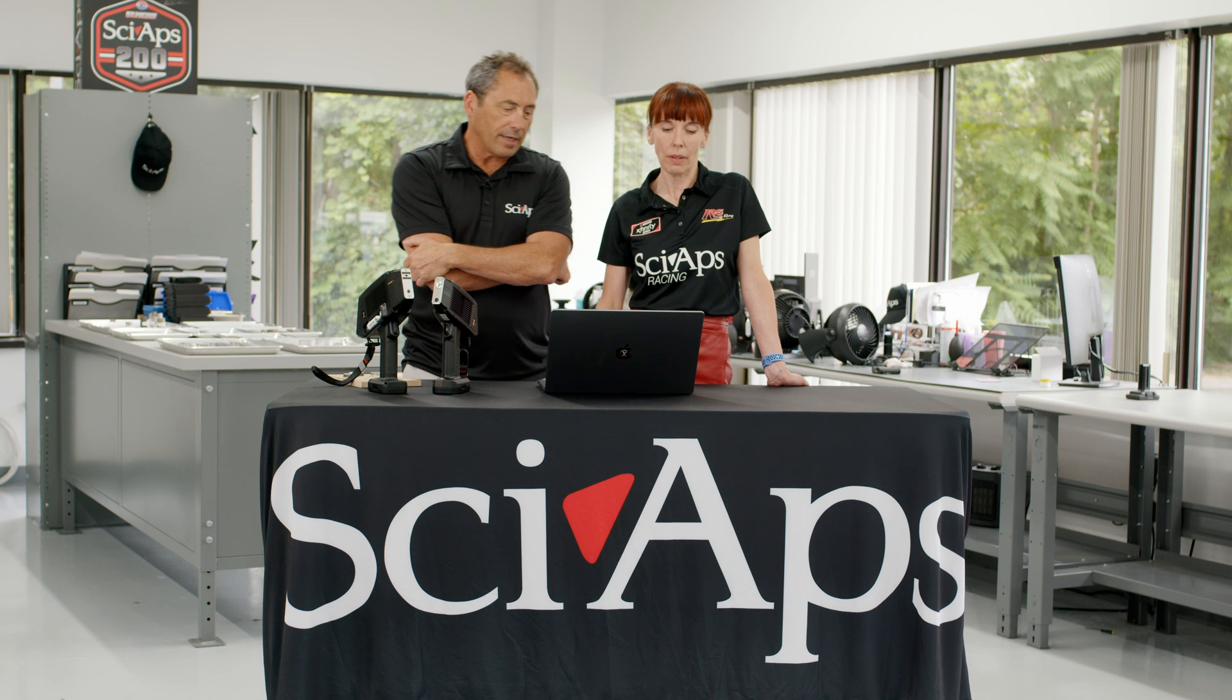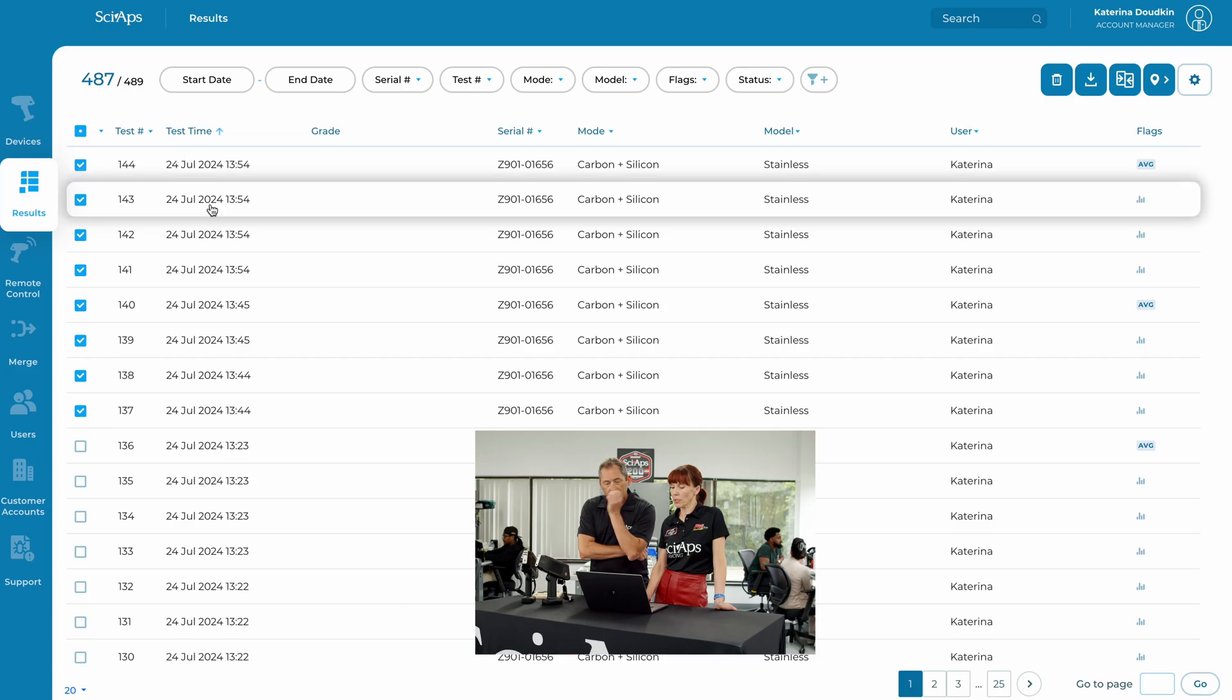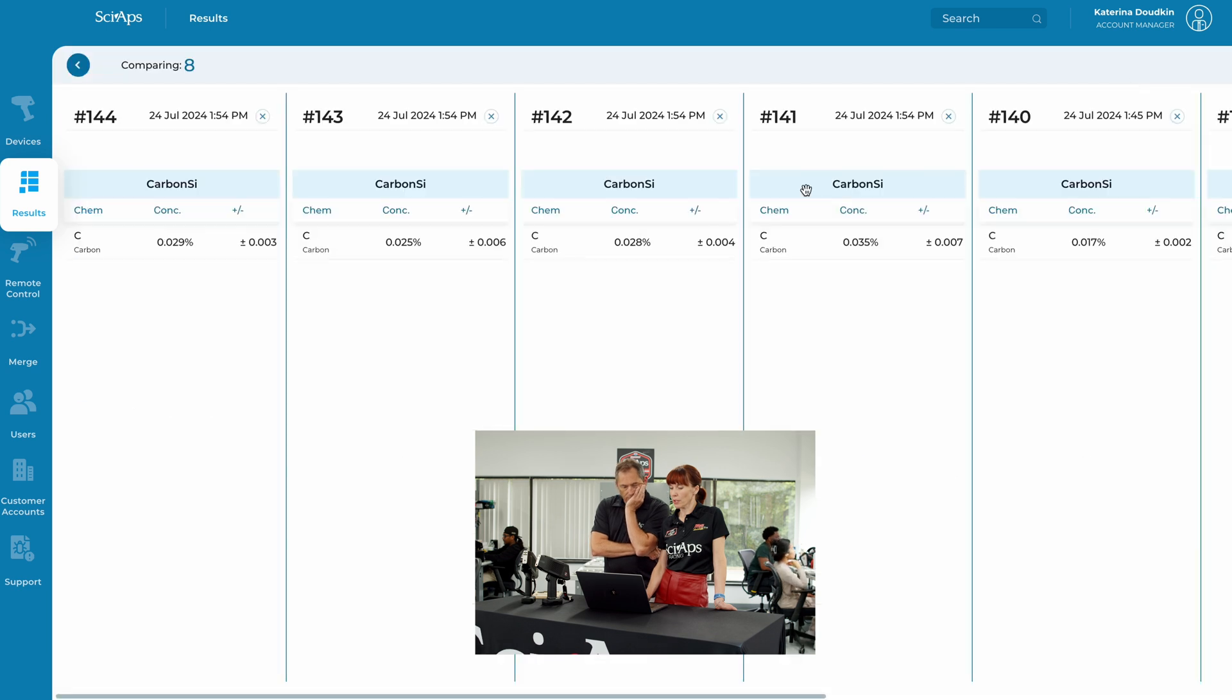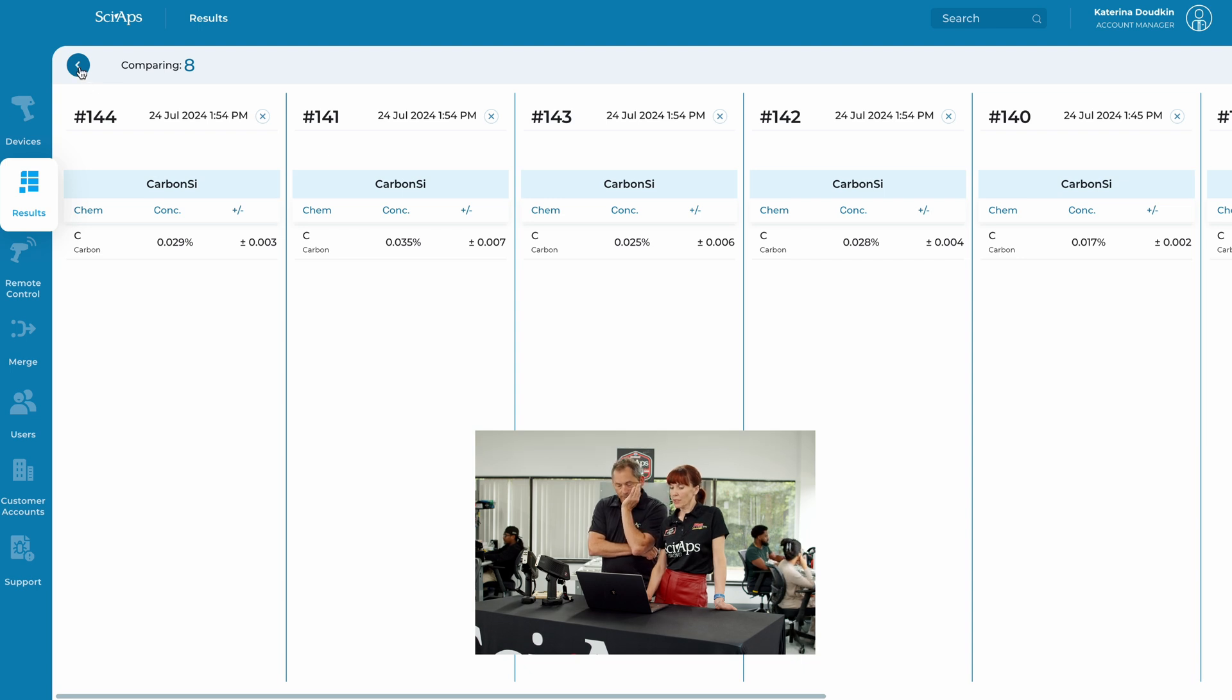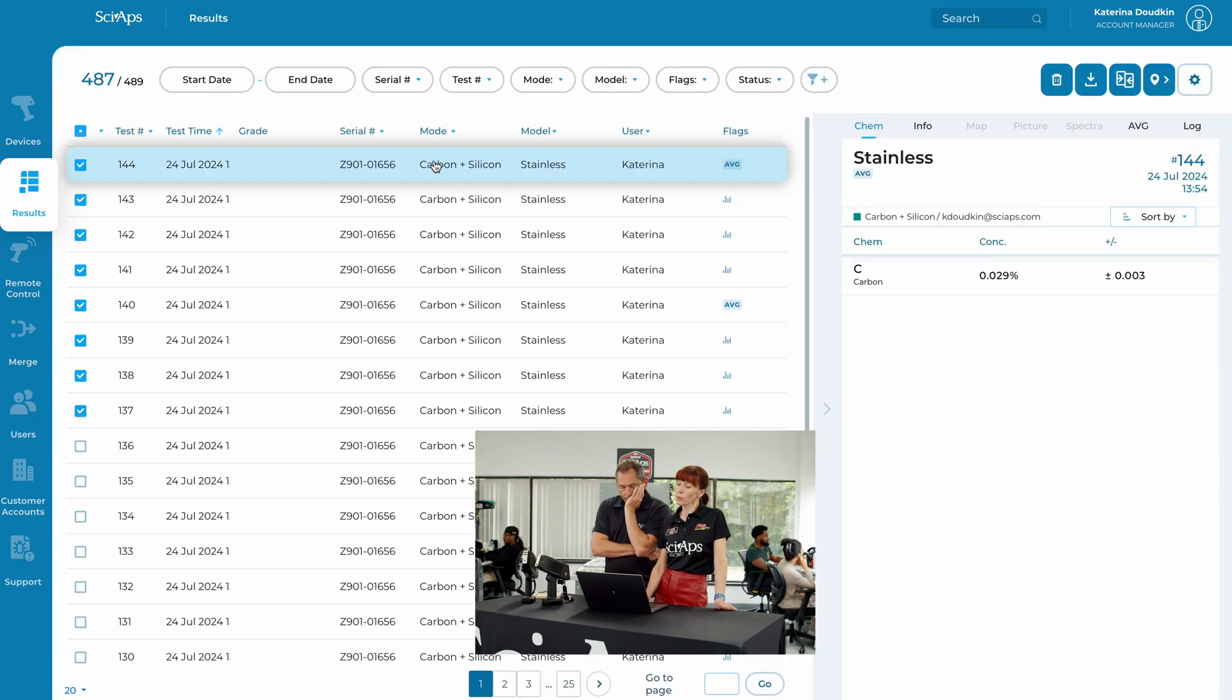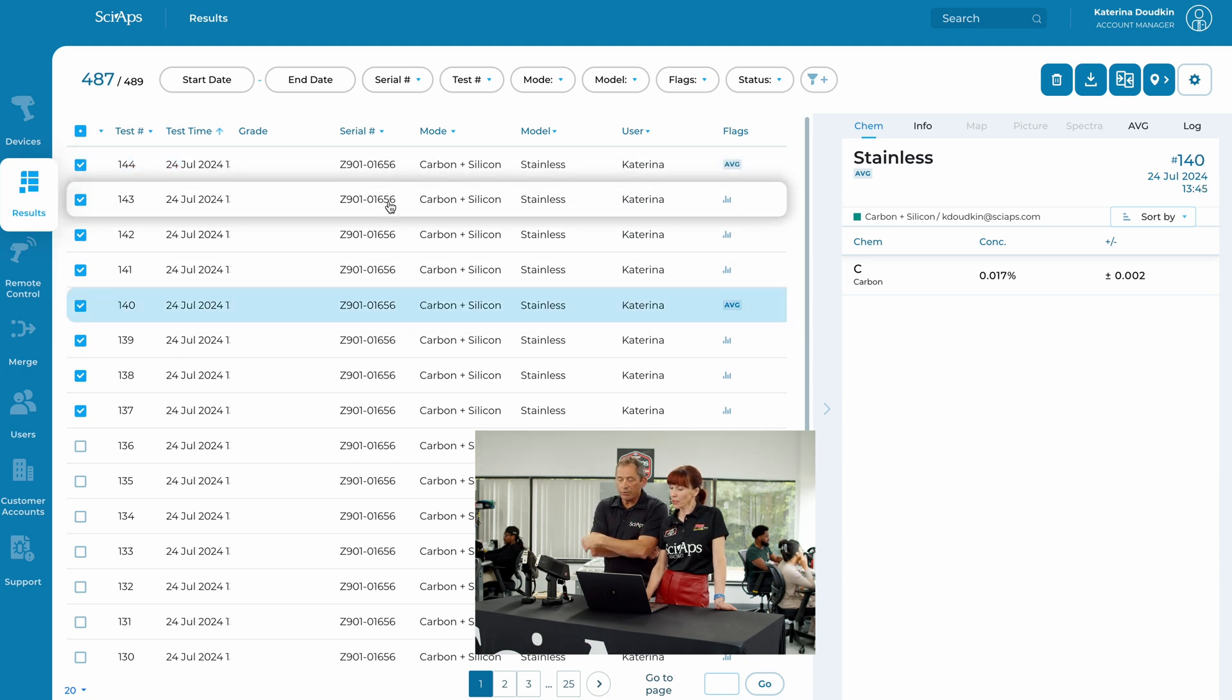So that's a huge, that's a really important feature, especially for PMI because carbon is not an easy thing to do in terms of testing. And there's a lot of less than perfect sample prep. So the fact that you can see immediately that your inspectors are doing good testing on carbon is a big advantage. And if at any point you need to compare the results side by side, you could select them and you could choose compare function. It's nice that you could move them side by side. So you could definitely see the sequence. Oh, these are all your different tests. I see. So you can compare and see what's going on. You can open individual tests and inspect it.